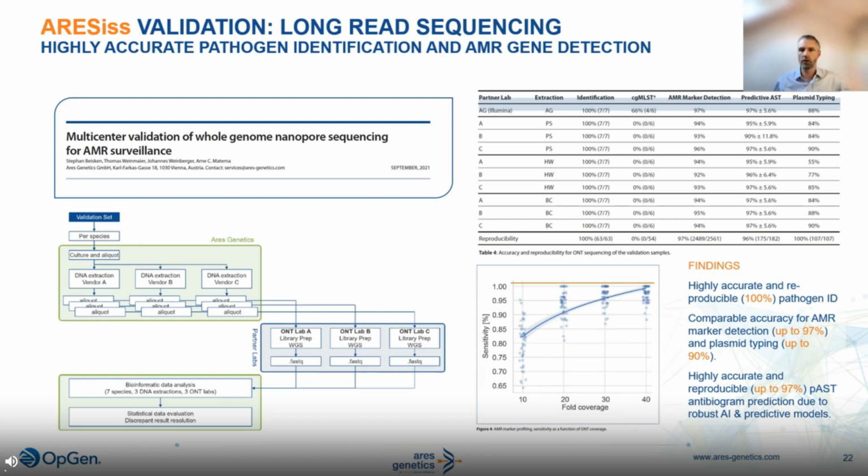Indeed, the base calling quality was reduced. We obtained quality or Q-scores on the Phred scale of about 11 to 12, compared to much higher Q-scores of 30 that we typically see with Illumina data. However, the assembly process resolves some of the associated problems. After de novo genome assembly, we assessed the average nucleotide identity of assembled genomes with a known public reference and determined that the error rate was only 3 to 4-fold higher compared to Illumina-based assemblies.